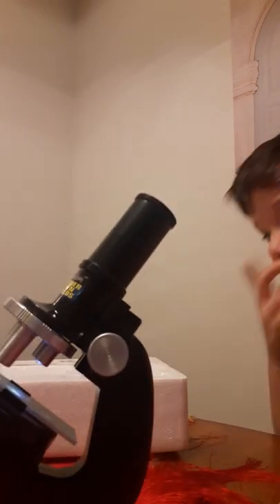Let me... okay, it looks like I got it ready. Let's see what is inside, boys and girls. So basically I have to adjust it. I have to adjust this microscope so I can see it better. Let's see, I got it, okay.